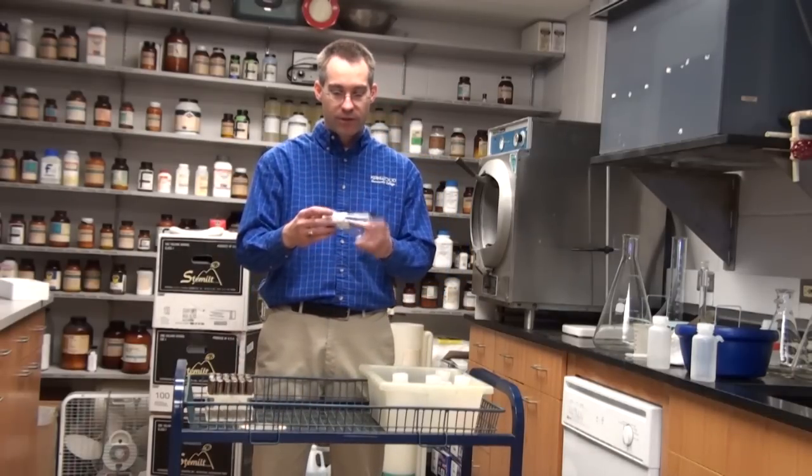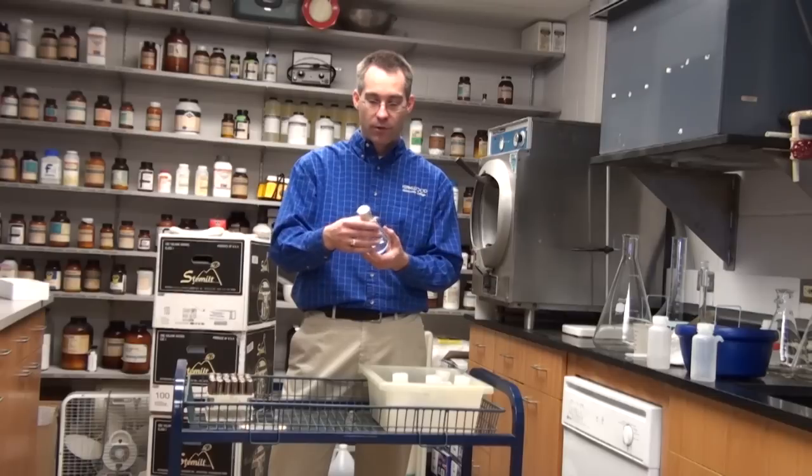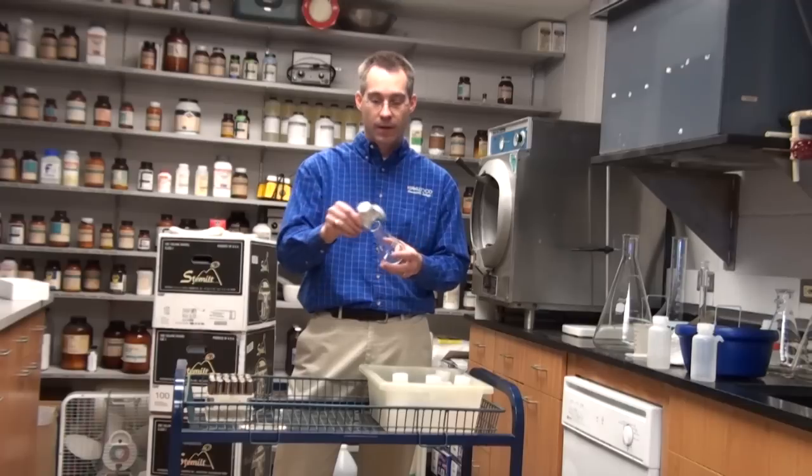Tin foil is another useful tool. What I usually do when I want a sterile Erlenmeyer flask is cap it off with aluminum foil and put a strip of autoclave tape on top. That way, once I pull it out, I can't get contamination from above — the only time it will get contaminated is if I remove the tin foil. It's a pretty good barrier for general growth media.